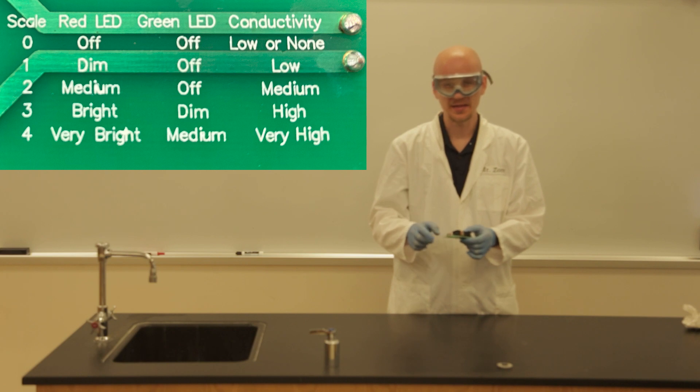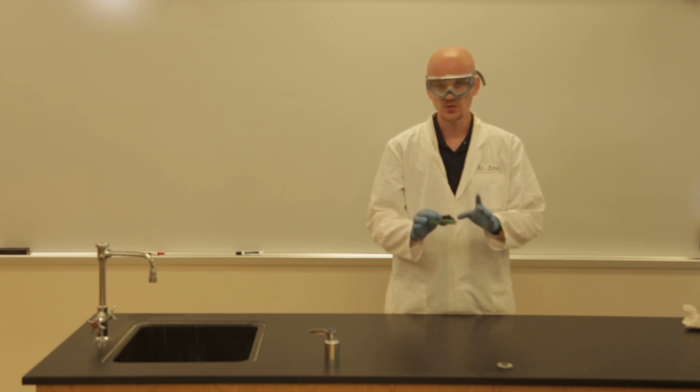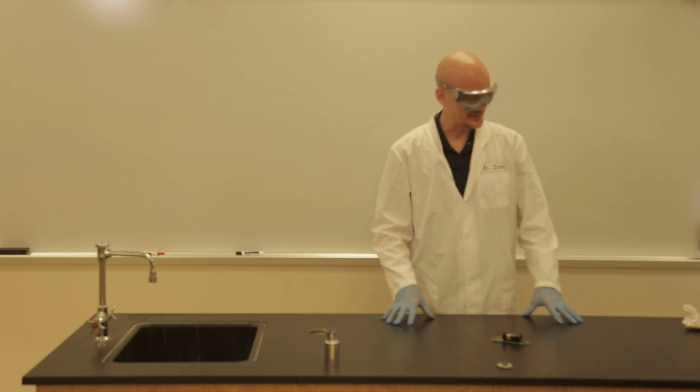So match up the light pattern that's on the LEDs here with the chart on the back to determine conductivity. Okay, so again, most important thing is to make sure that your sample touches both of the probes on the conductivity meter. So let's go ahead and get started.